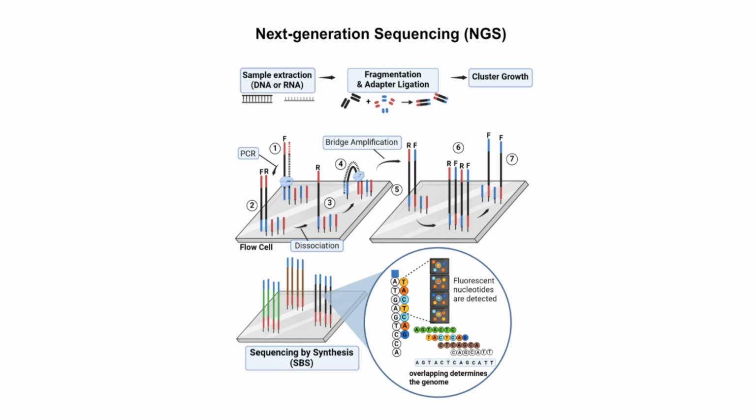Previously, we discussed Sanger sequencing, which relies on capturing signals when specific bases are added to a growing DNA strand. Today, advances in technology have made DNA sequencing much more efficient and high throughput, especially with methods like sequencing by synthesis. In the modern approach, DNA is first fragmented using an enzyme.